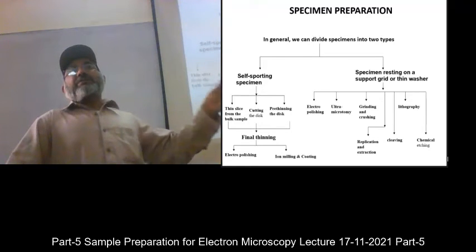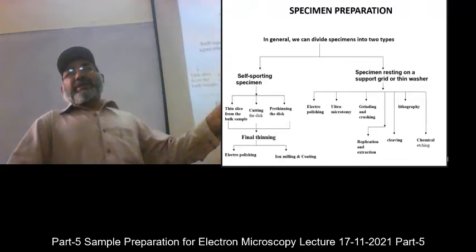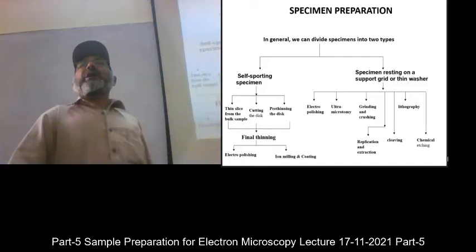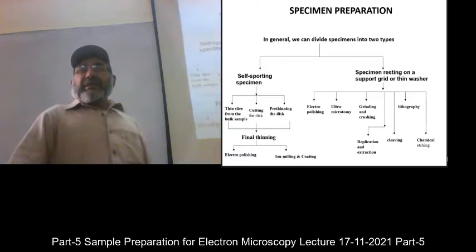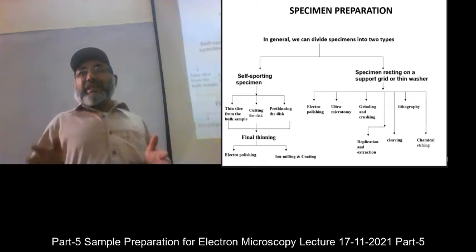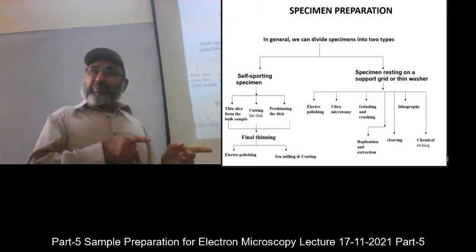But if you pick the sample from the quartz region, it is not representative of the 95%. So technically people question whether your sample is really representative of that particular material.